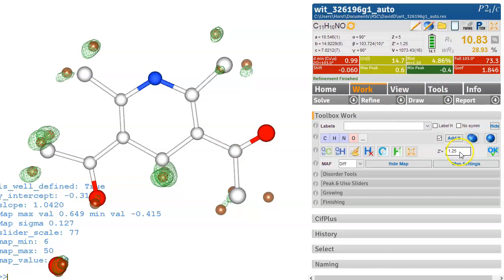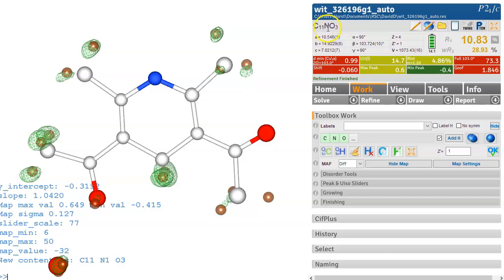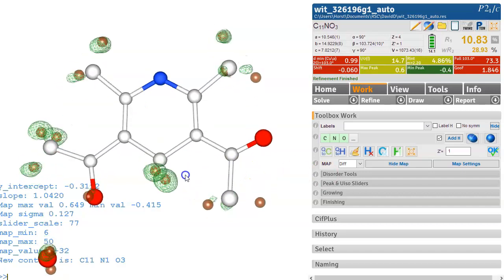Oh first of all Z' is 1.25 so the formula right now is not quite right if you put in one then it would adjust with what's on the thing if you click on the OK so it's C11NO3. So this is what the formula is at the moment is that prime there's one independent molecule in the asymmetric unit.